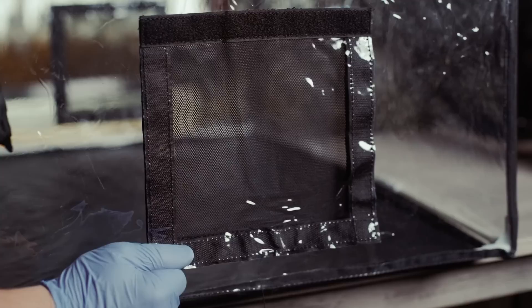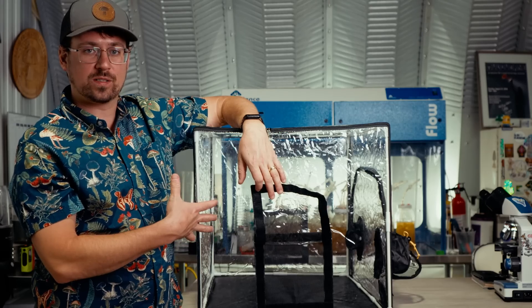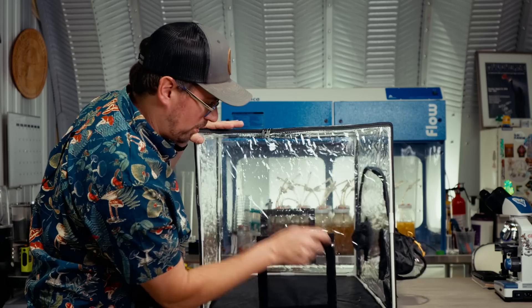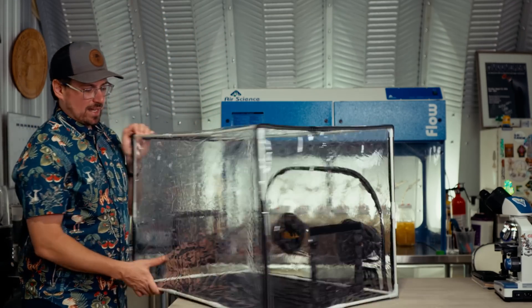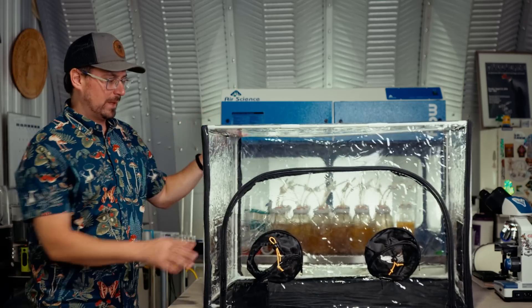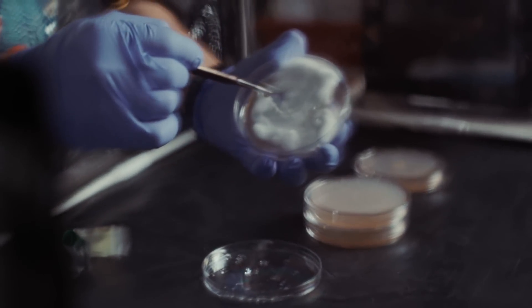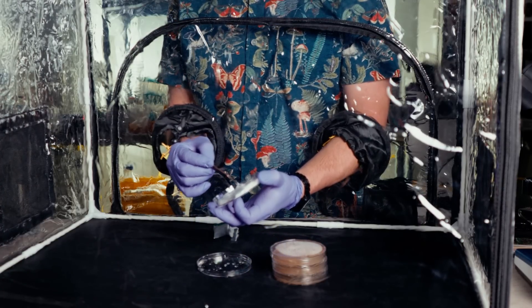I also noticed there are side vents. Maybe these are to prevent condensation if you're working with hydrated bulk substrate or something with very high moisture content, to keep the sides from fogging up. I don't really know what these side vents are for besides humidity control. On the backside, it's one solid piece. It didn't take that long to put together — maybe five minutes with two people helping. Overall, I think the quality is very surprising. The biggest test would be how it holds up over time, but it's just plastic and there wasn't a whole lot of investment.